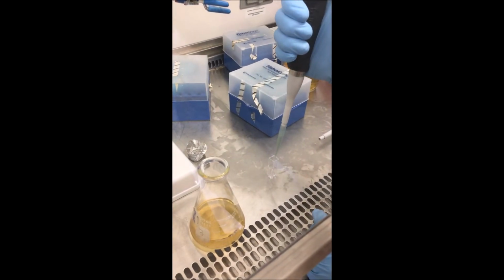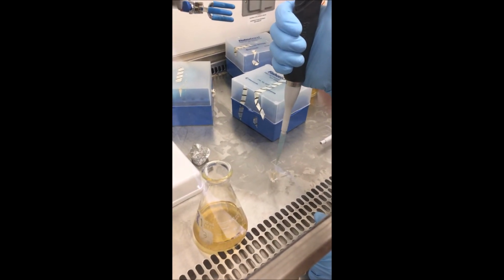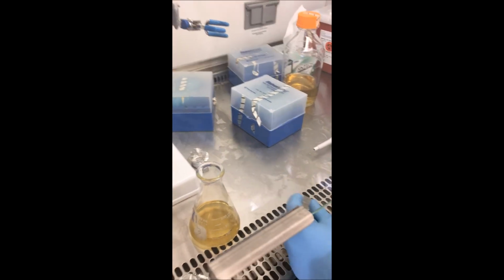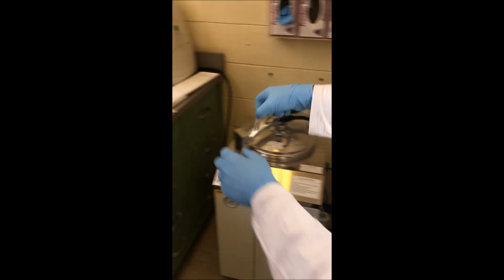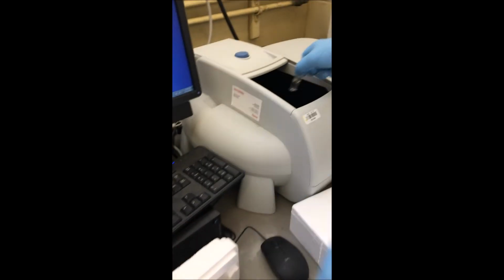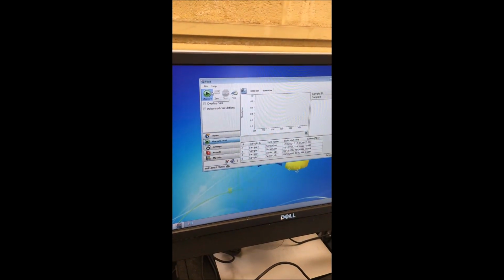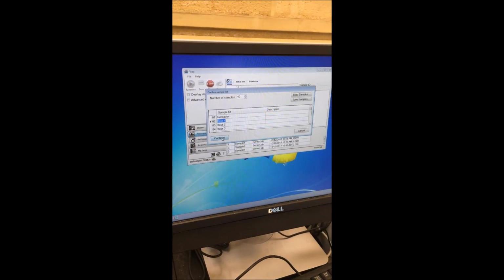If the spectrophotometer readings went above 1, then the samples were diluted in half with fresh TSB media and the absorbance readings were adjusted to reflect this. Readings were taken every 6 hours until the bioreactor had to be shut off for cleaning. Once the experiment was completed, the bioreactor and all glassware were again cleaned for the next lab group.